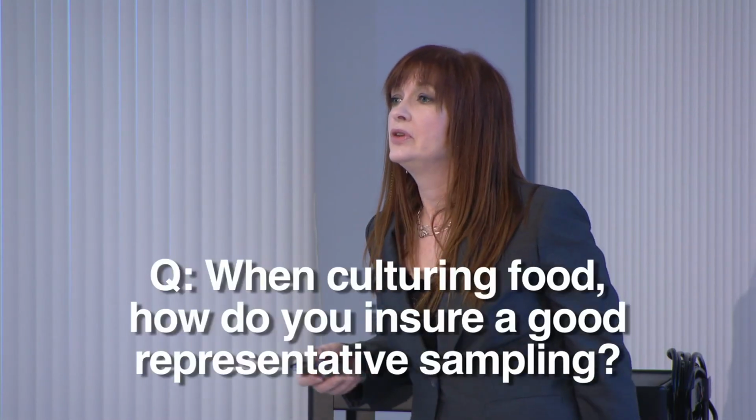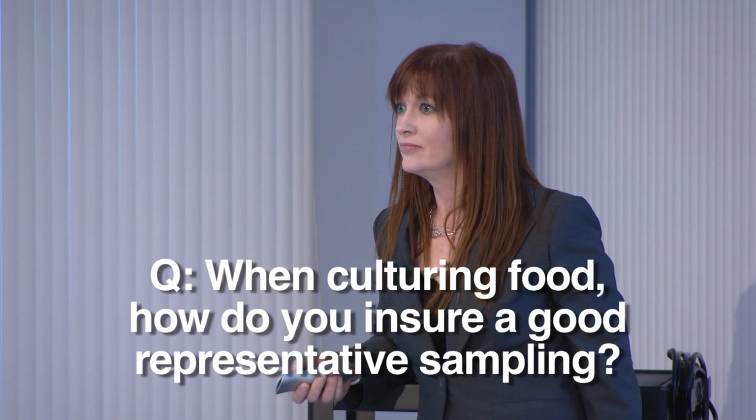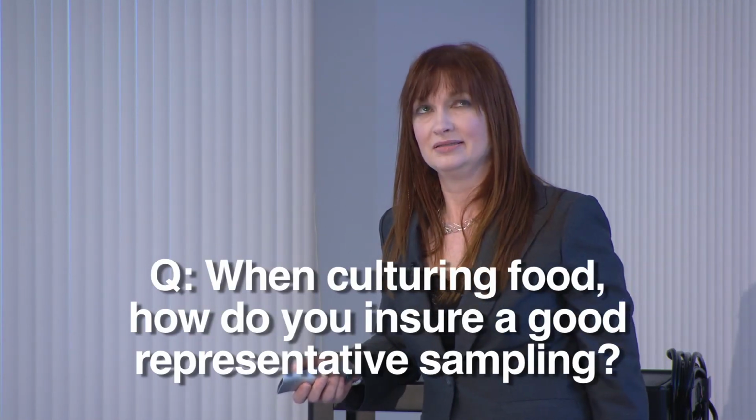Sure. When you're food sampling to culture it, is there a particular way that you're getting a representative sample, or do you culture the core? Yes, that's an excellent question, and one that we struggle with all the time.